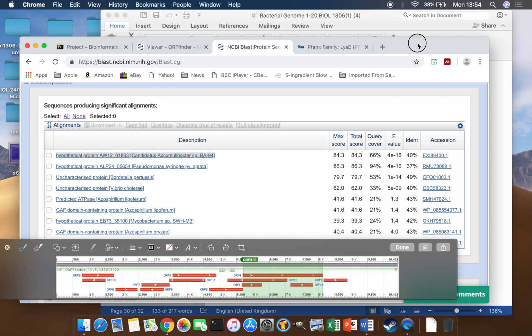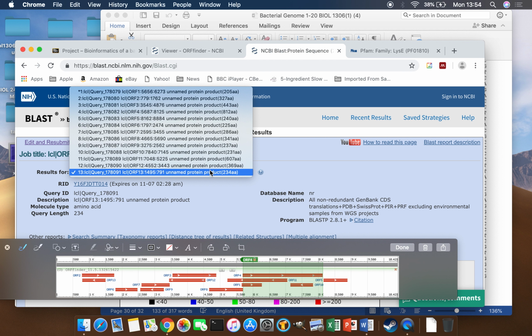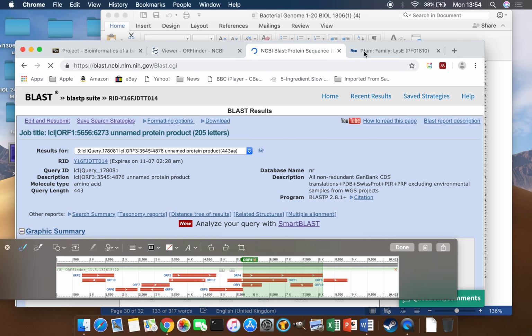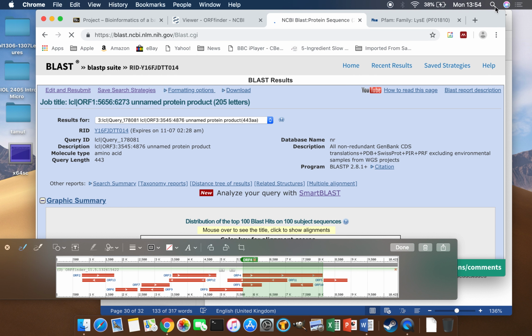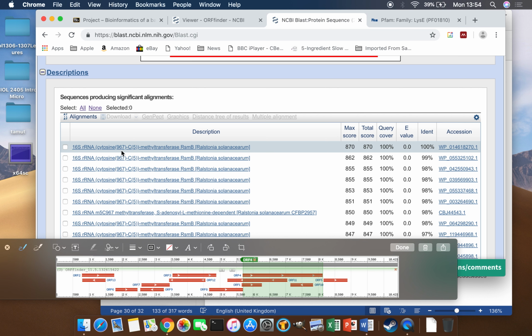And with that, you've now got something to write about. You've got all these interesting terms, and essentially, the person who's in charge of this section is going to be going and looking up what these terms mean and how do they work together. So 16S ribosomal RNA, cytosine methyl transferase, RSMB. What does that thing mean? And you're just going to pop that into Google and you're going to search for papers on it and you're going to find some. Guarantee it.